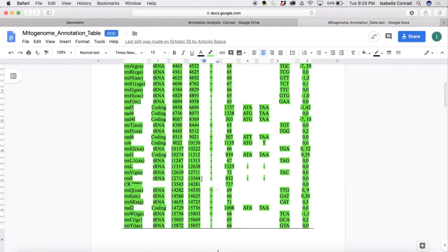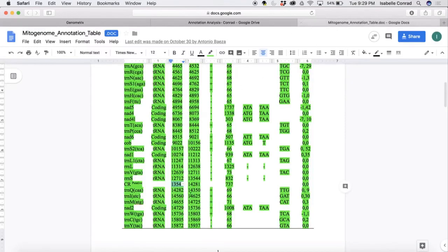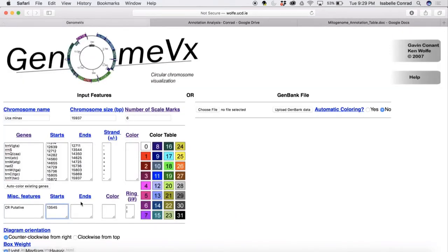And copy those numbers, and then go paste it back in there. Delete the extra space. There is the end base pair and we're going to paste that for the control region.